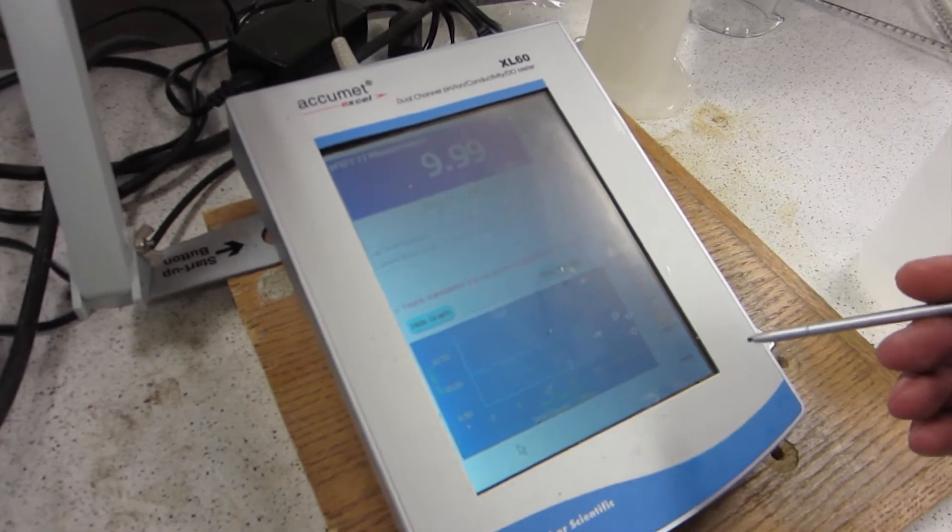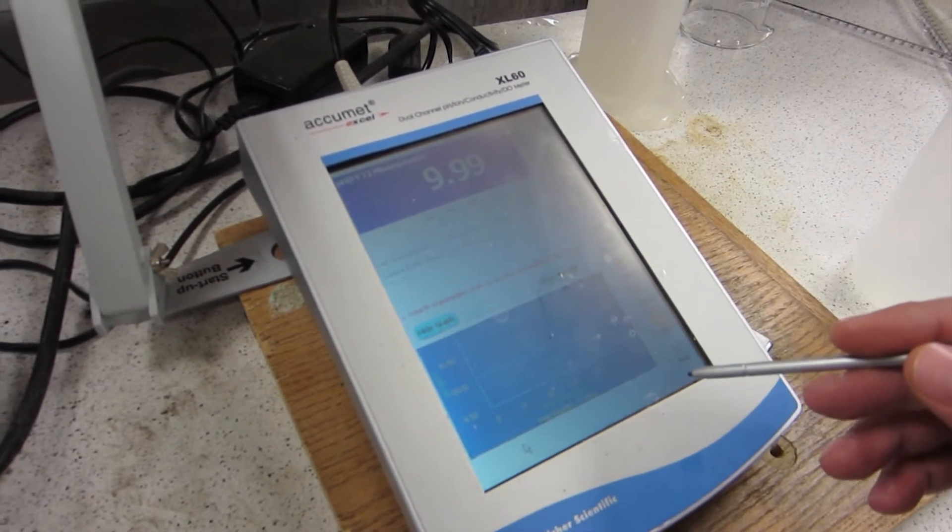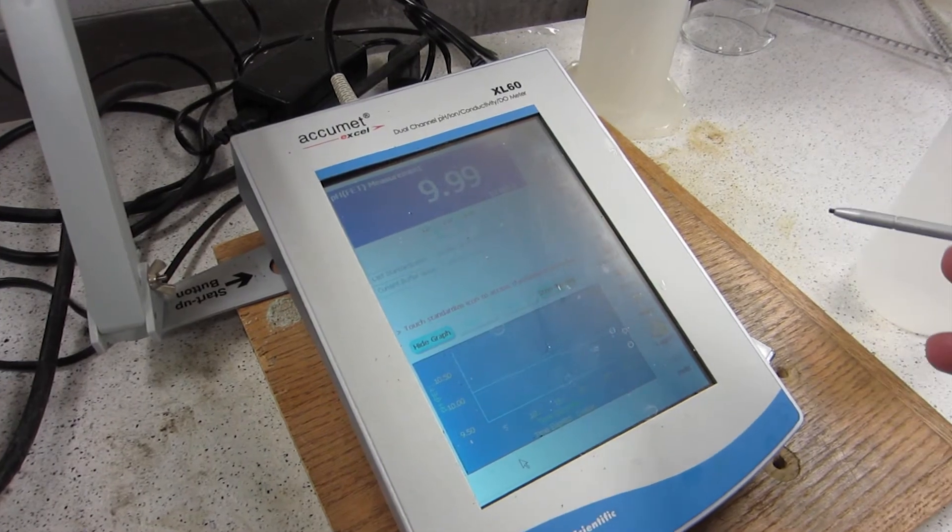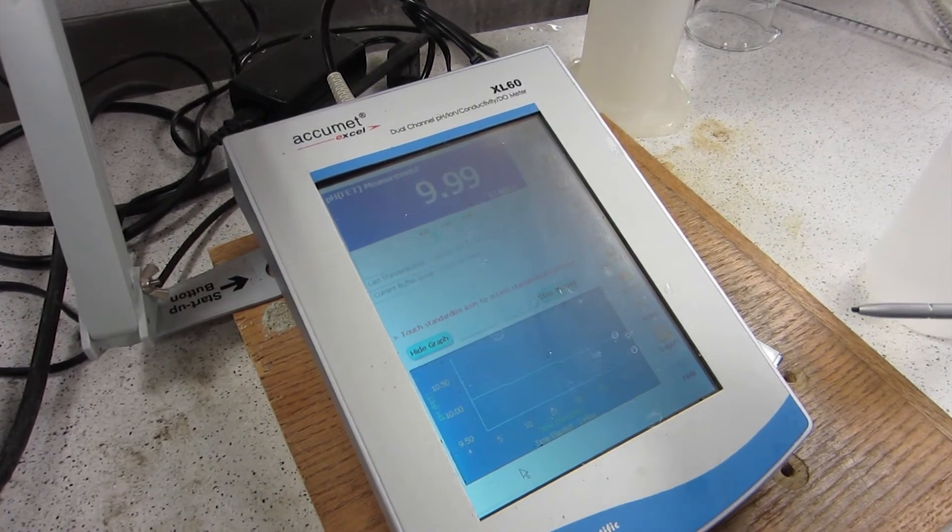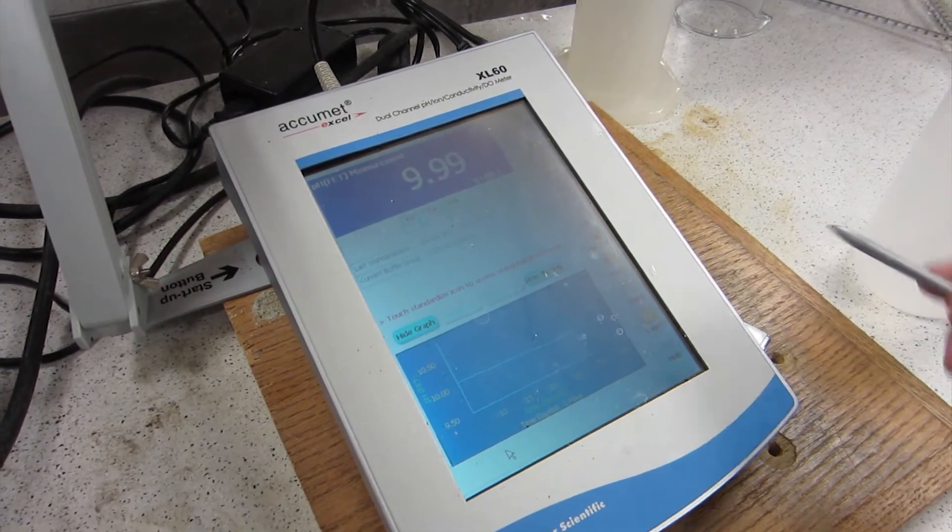Okay, that's the important part. So don't get off of this screen while you're trying to take data, and don't clear it because you'll get rid of it. Okay. So keep it on this screen while you're collecting data.